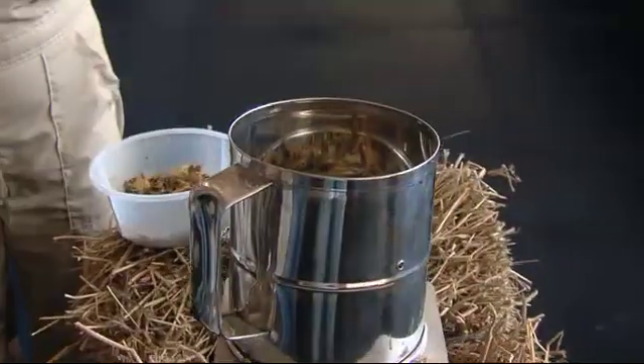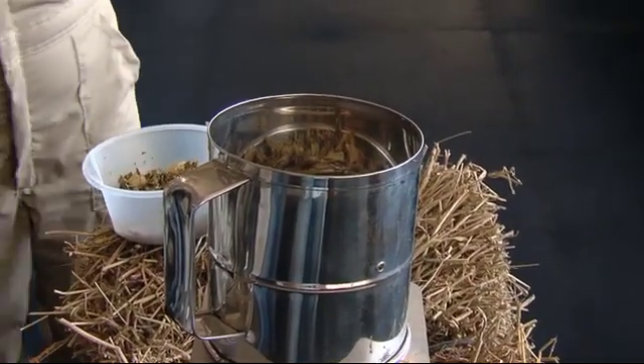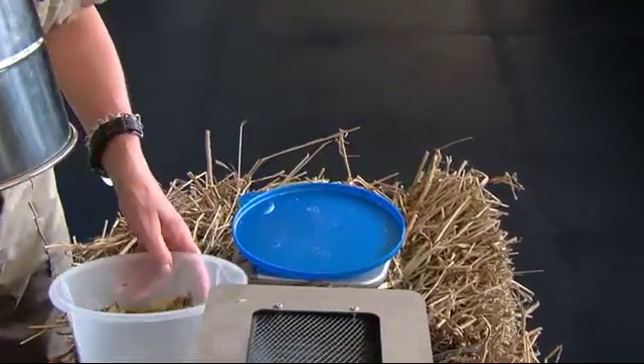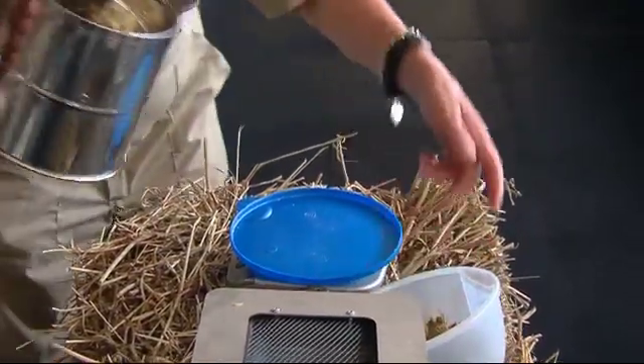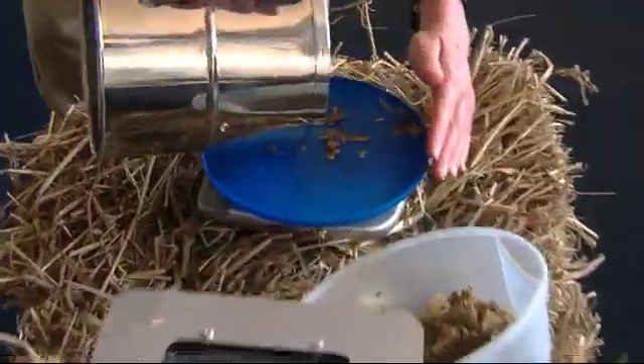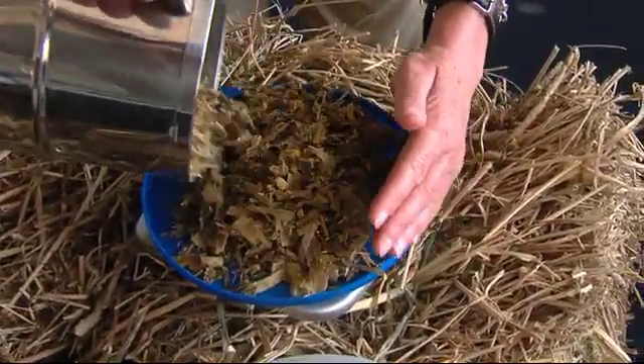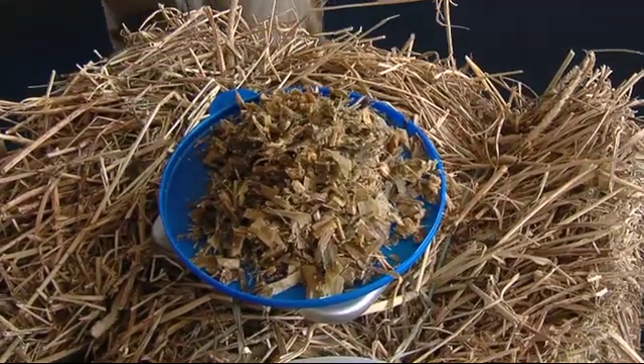Once the product has dried down, you simply pick up the Koster oven, put the product back onto the scale, get the final weight, and through subtraction you can determine what the moisture content is of the ingredient.